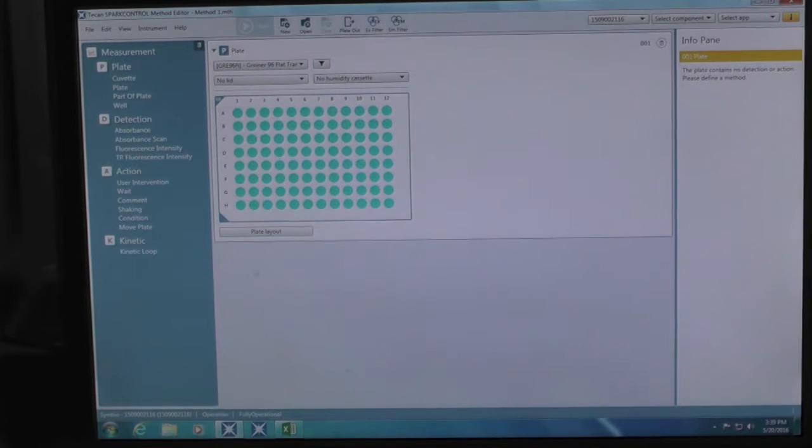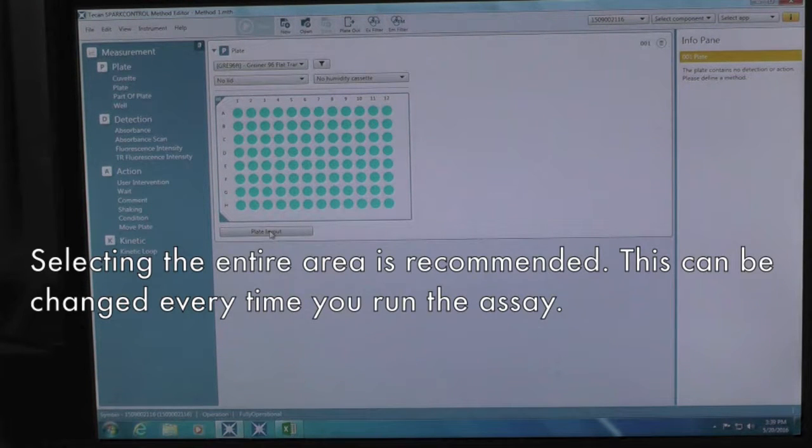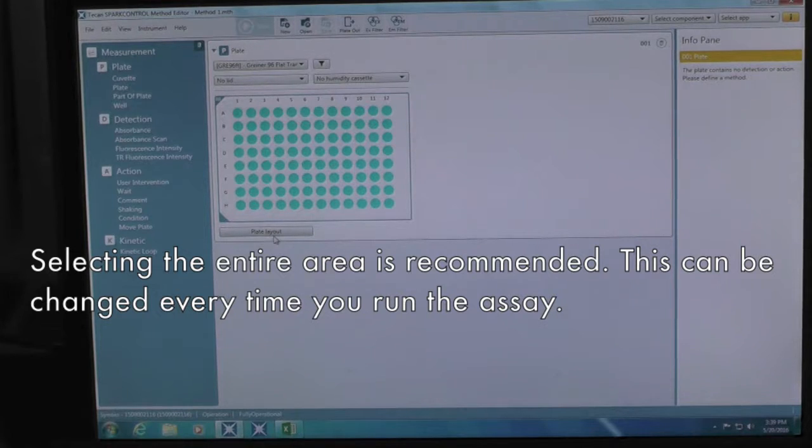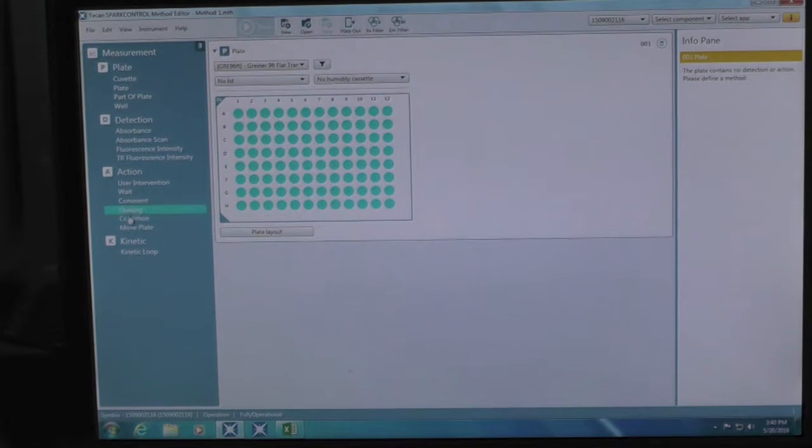Then you can highlight the read area of your plate. It is recommended that you highlight the whole plate here. Then once the program is set, each time you run this preset program, you can highlight the specific wells for each scan.